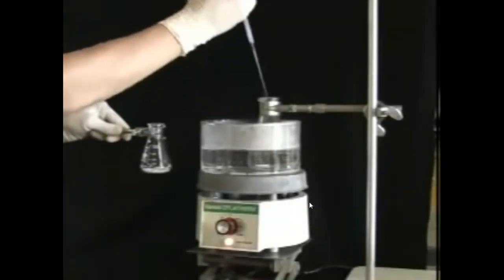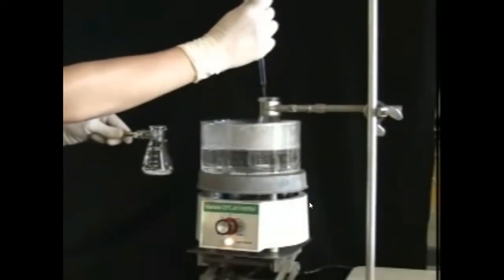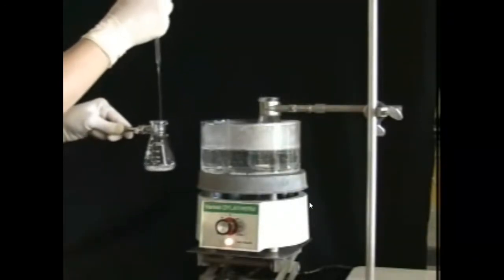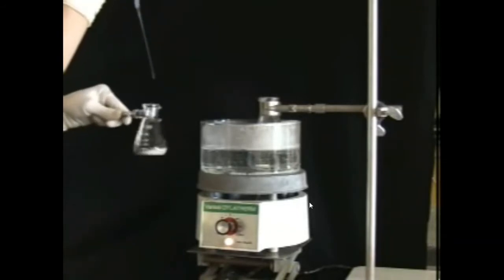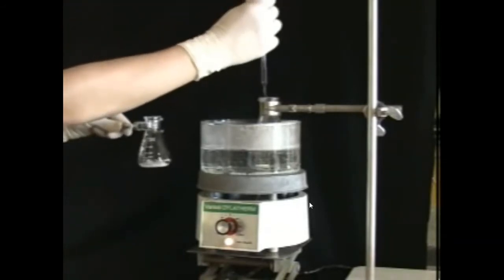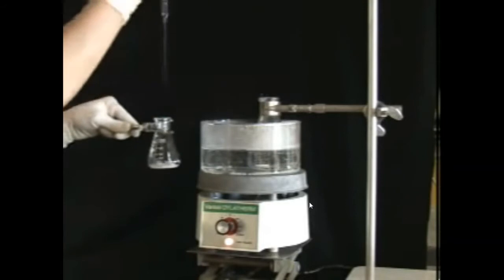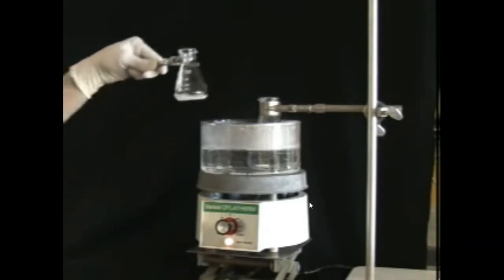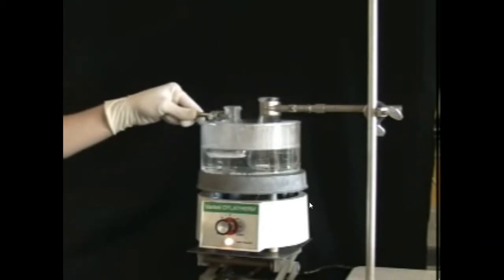So step two, still step two we are doing. When dissolving your sample, use a minimal amount of hot solvent. This will ensure good recovery of crystals in the end. Look at the use of the pipette. Add hot solvent in small amounts, swirling and heating in between each addition until the sample just dissolves. She did not completely dissolve it, all right? Caution. If it won't dissolve, it's probably an impurity.